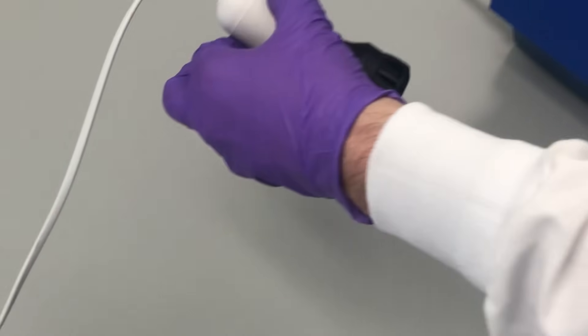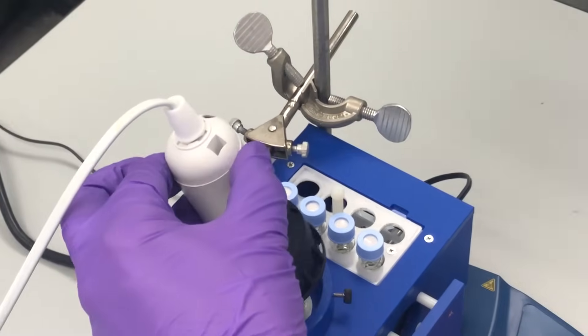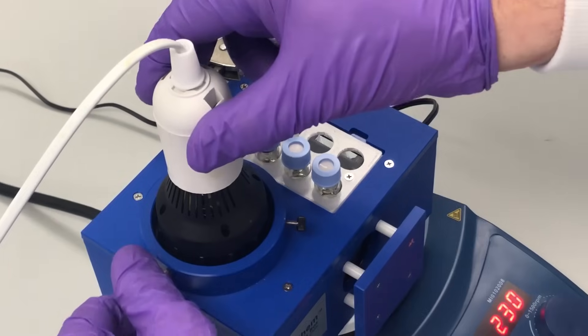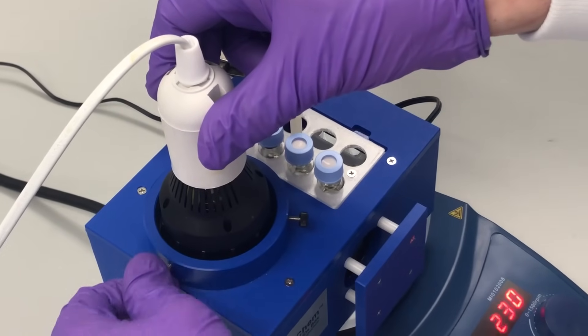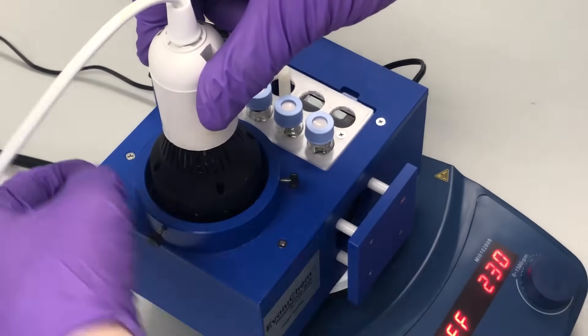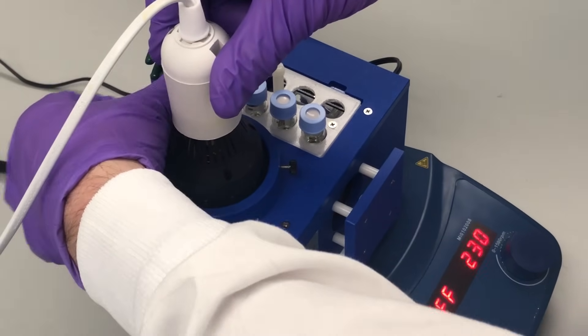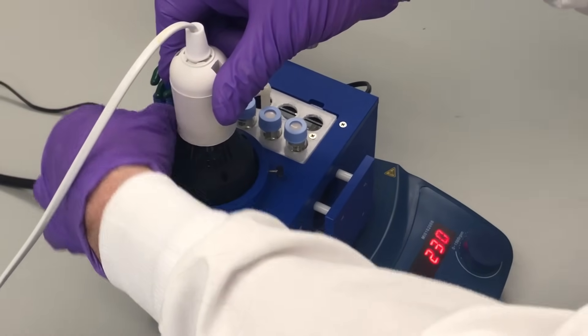Once your vials are prepared, simply place them in the appropriate EvoluChem holder and place the holder into the reaction chamber. Then simply secure the appropriate light source for your reaction to the light source mount and activate the light source.